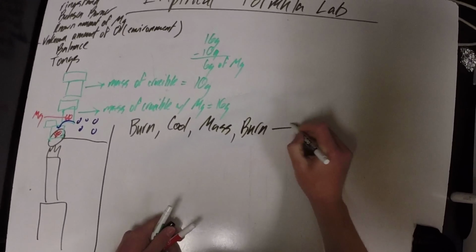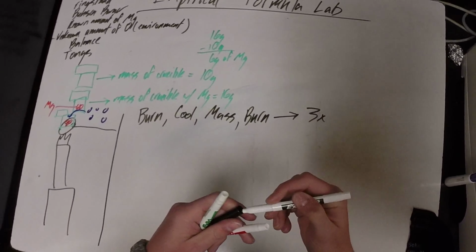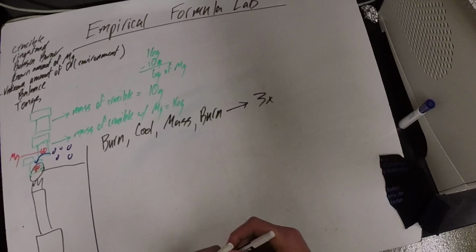You're going to do that 3 times to make sure that the reaction is complete.